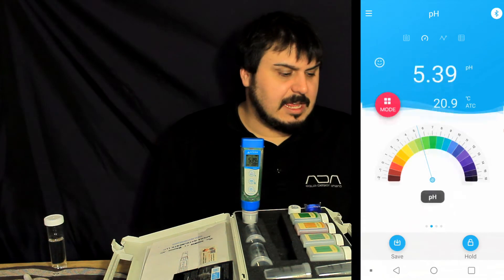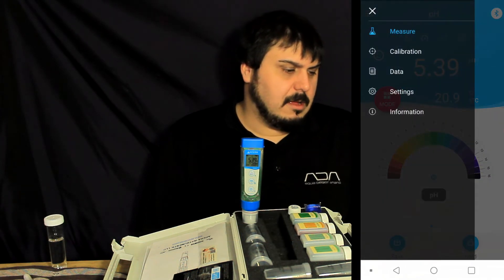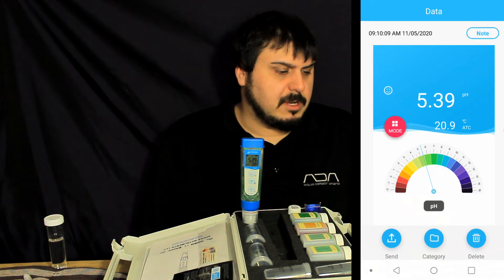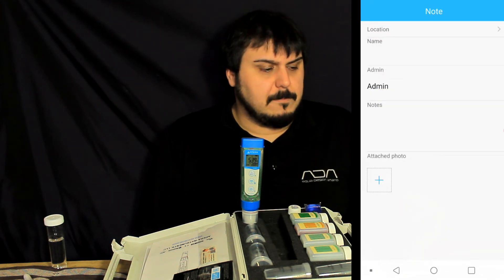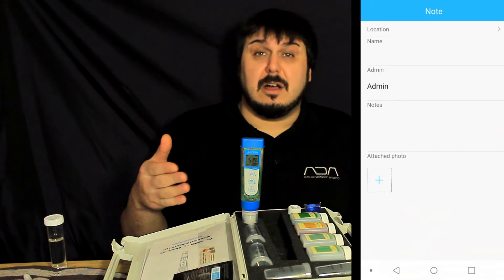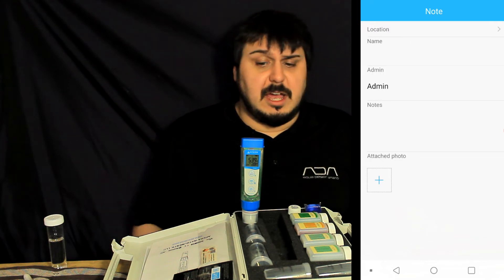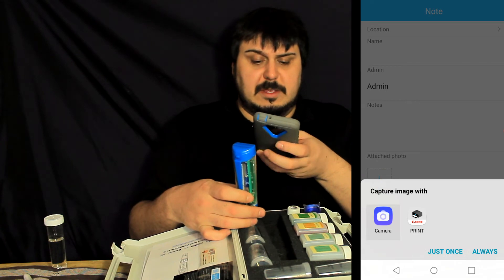At any time you can take a picture and save your reading, and this goes into the cloud. You can go to the settings button at the top and click on your data to see the saved reading. There are really cool things you can do — you can click the note button in the top corner, add a GPS location to where you took your sample (great for field work), give it a name, add notes, and even attach a photo.